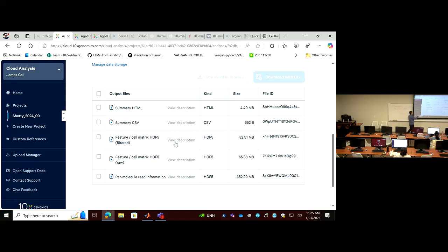A previous version of Cell Ranger gave you 3 files containing the matrix, gene names, and barcodes, but now they merge everything into this HDF file, an H5 file, a common file type used to communicate across different platforms right now.